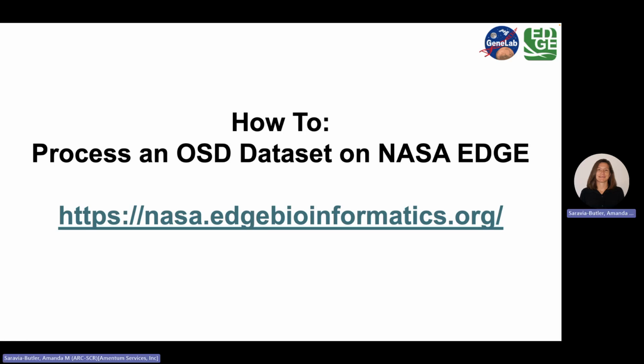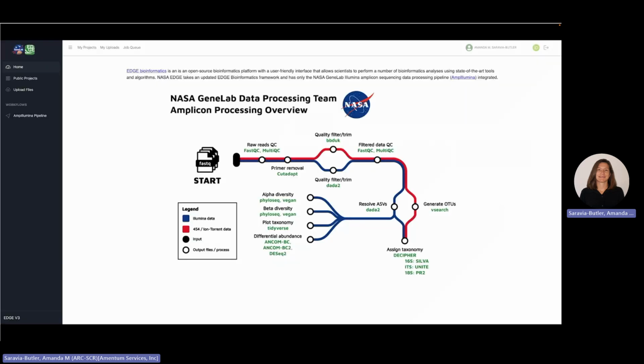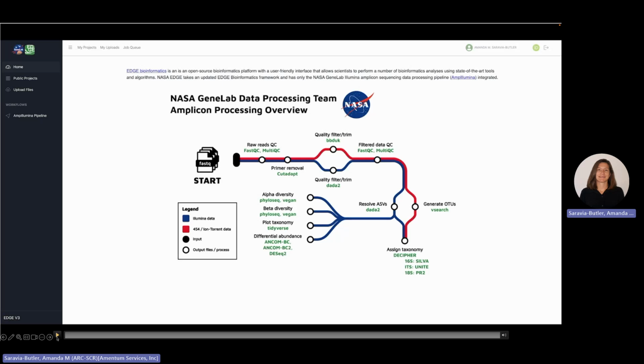In this video, I'm going to show you how to process an OSD dataset on the NASA EDGE platform. So you'll start by logging into the platform at nasa.edgebioinformatics.org. If you're not already logged in, you could watch the login video. And then once you're logged in, you'll see the home screen here.